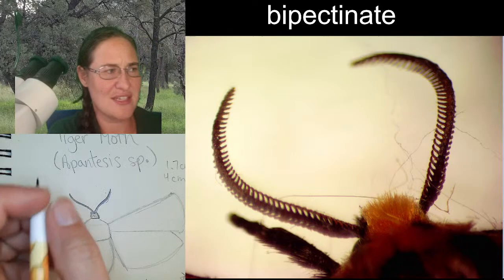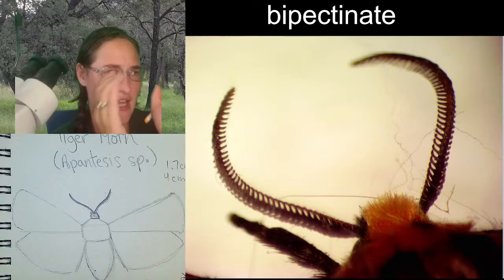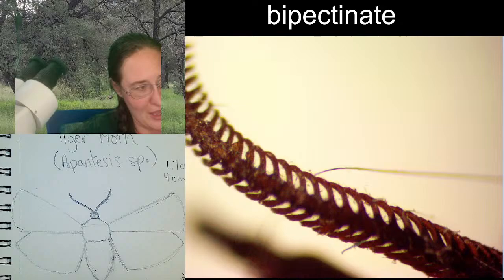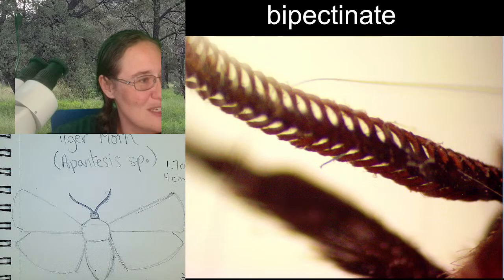This bipectinate antenna almost looks funny because at some point in the bottom they kind of curl up and they look like they almost connect to one another, but they are all individual and they're all separate. They're just hooked a little bit coming down. And you know what? When we zoom in on that antenna like this, it reminds me of a spine. Cool.